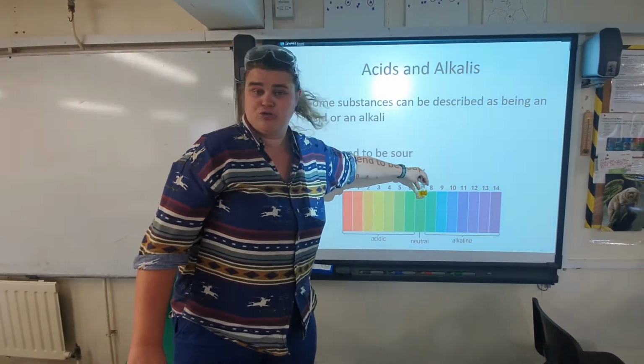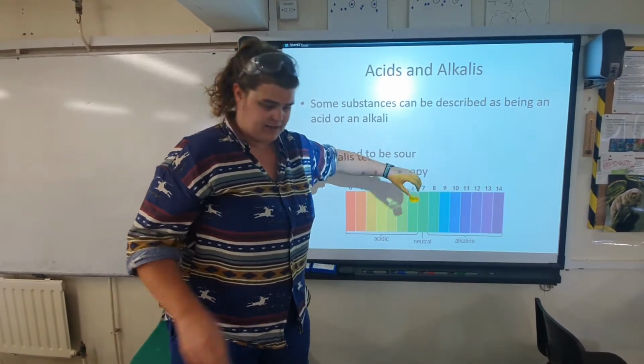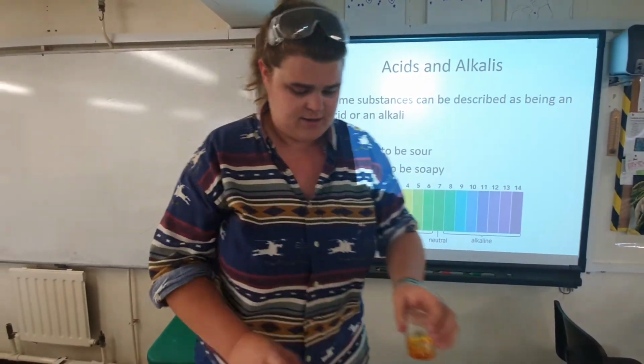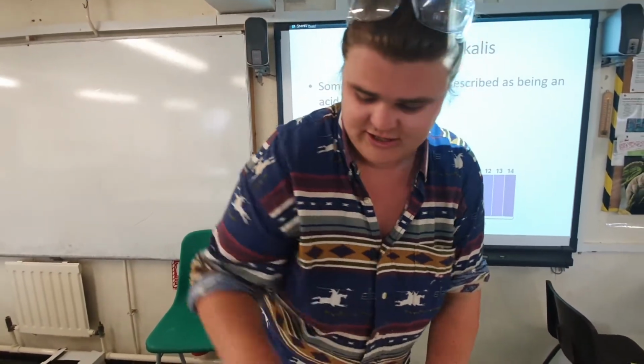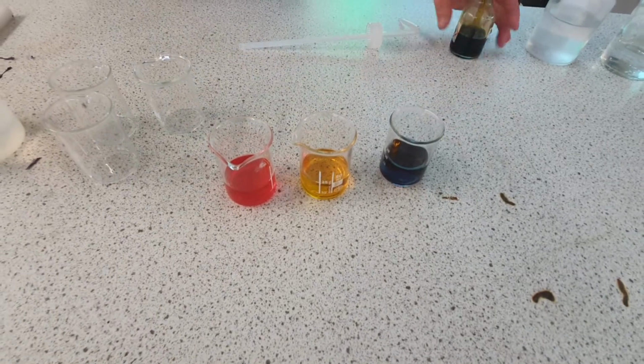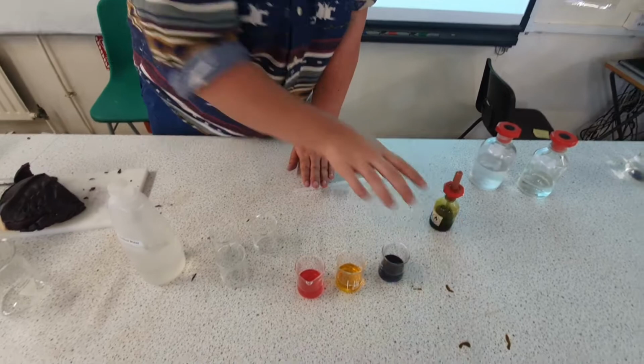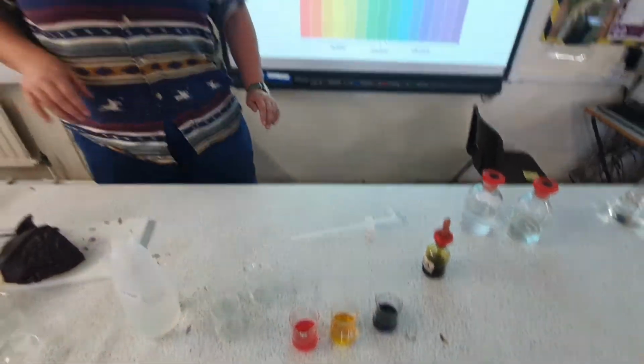We'd expect it to be neutral, okay? This one might be slightly acidic, who knows why. So there, you can see, if I put those all next to each other, three colourless liquids with the same indicator placed in them have gone three completely different colours.